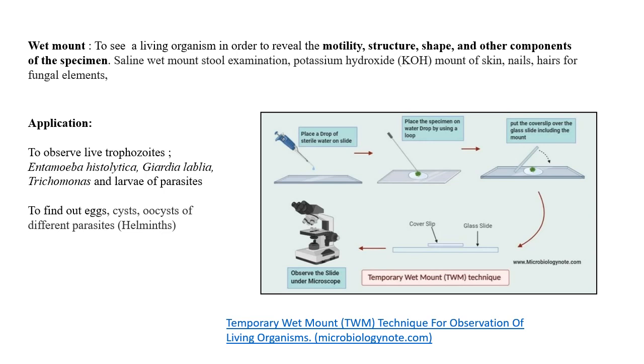So it's a basic method and very useful, especially to see the protozoans. To see the protozoans, it is a very useful technique. And if you want to see whether some organism is motile, moving, you can use this technique, and this is very helpful to visualize the fungus.